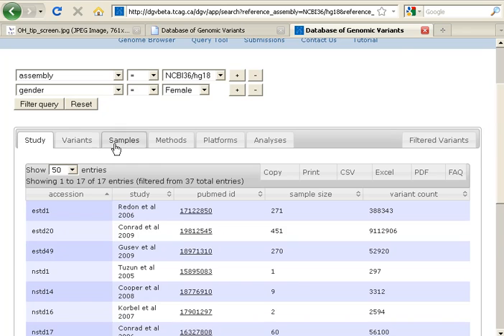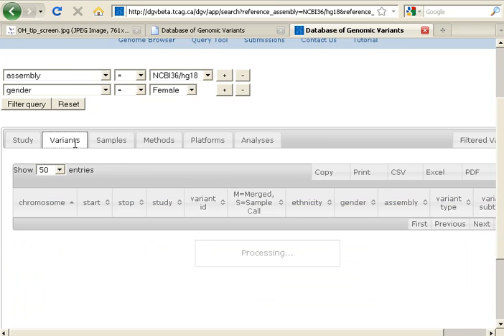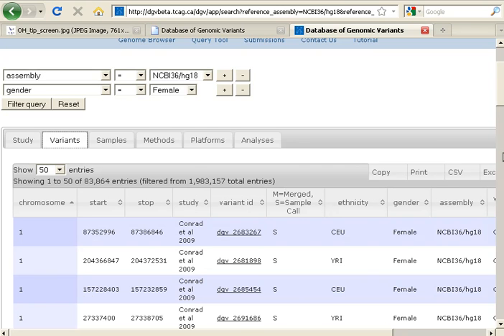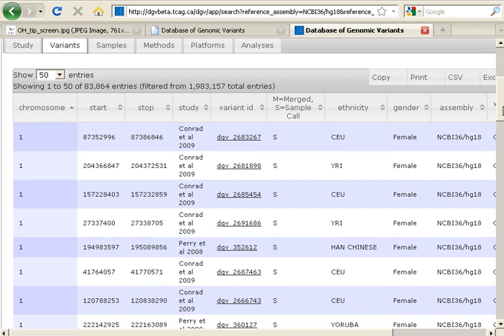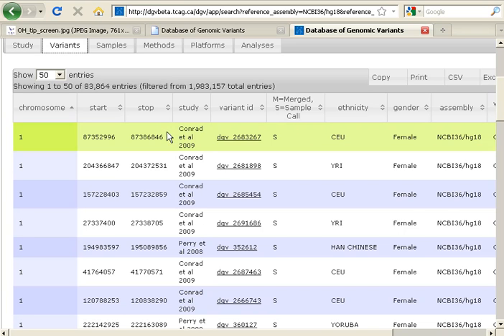I'm going to click over onto the Variants tab, and again we're getting this processing message. When our results load, you will see we have a variety of different categories of information — the chromosome start and stop of the variation, as well as a link to the DGV report for that variant.